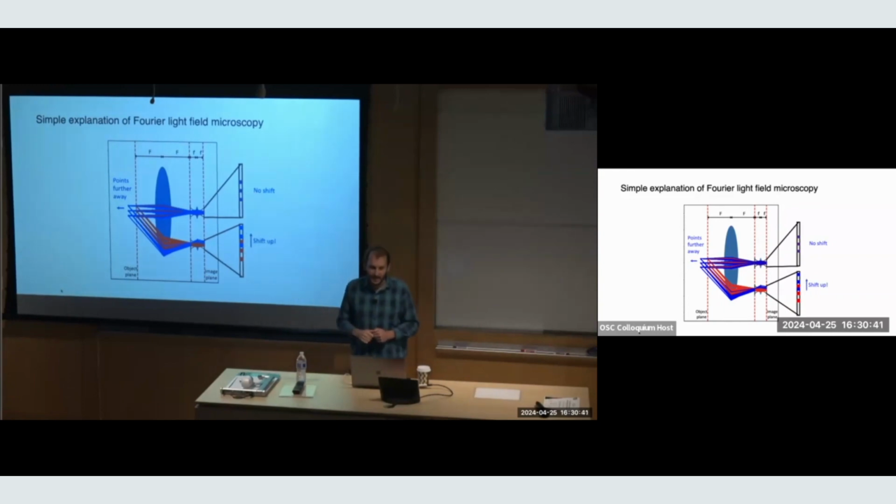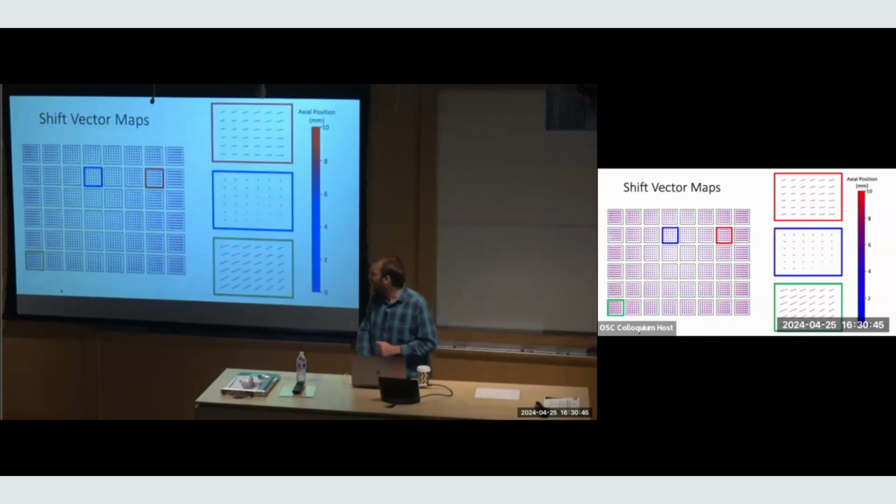right? And so what you're left with is an imaging system where things shift due to how far away they are, right? Shift relatively across the cameras due to how far away they are. And so if you take some points, and this is experimental data, and you just move them away, and as you're moving them away, they turn from blue to red, then you capture data like this, right? Where each depth is encoded by the blue to red color, you just see this kind of expanding image effectively, kind of expanding laterally outward. And so you can use that information to just recover 3D depth, not surprisingly, right? If you look at one point in the scene, you can see how it's shifted in relation to the other cameras and back out its 3D position.